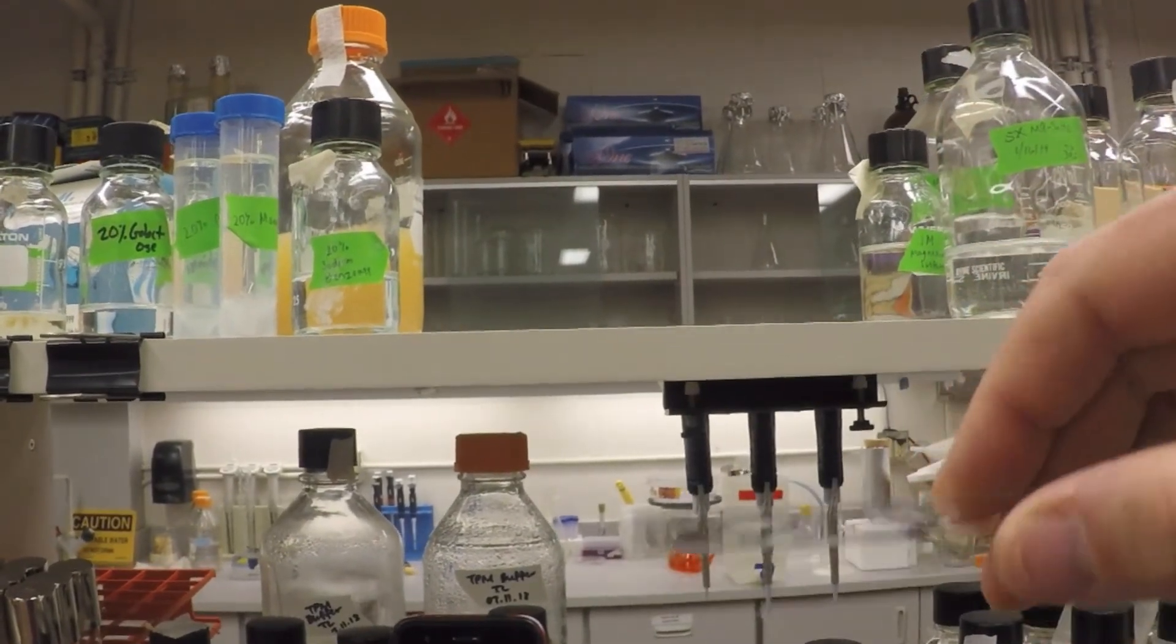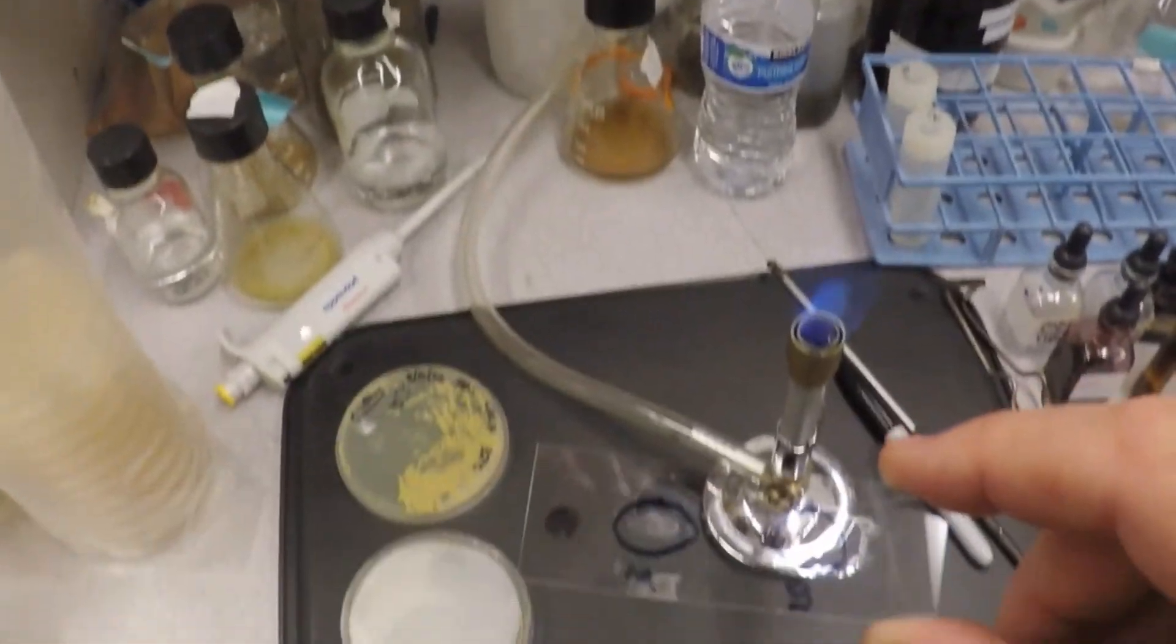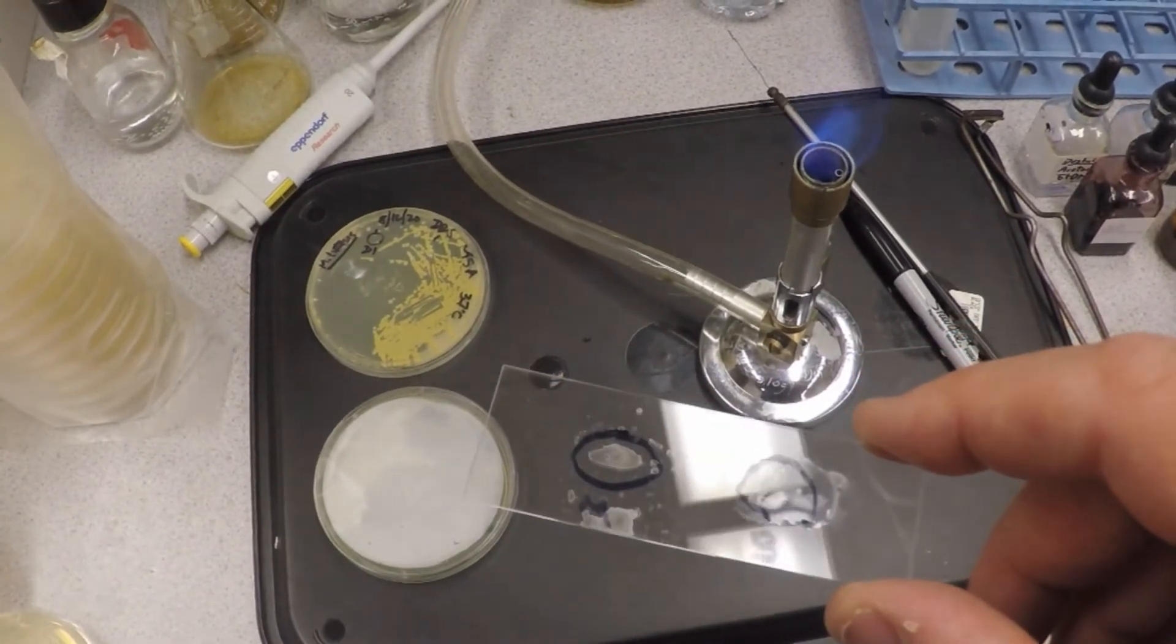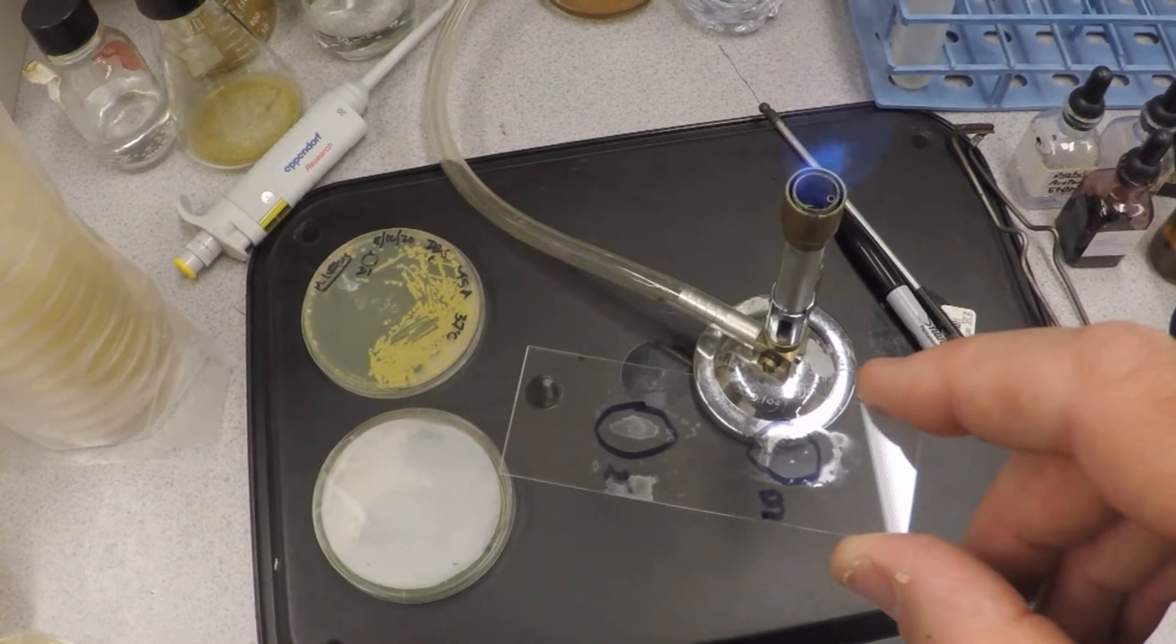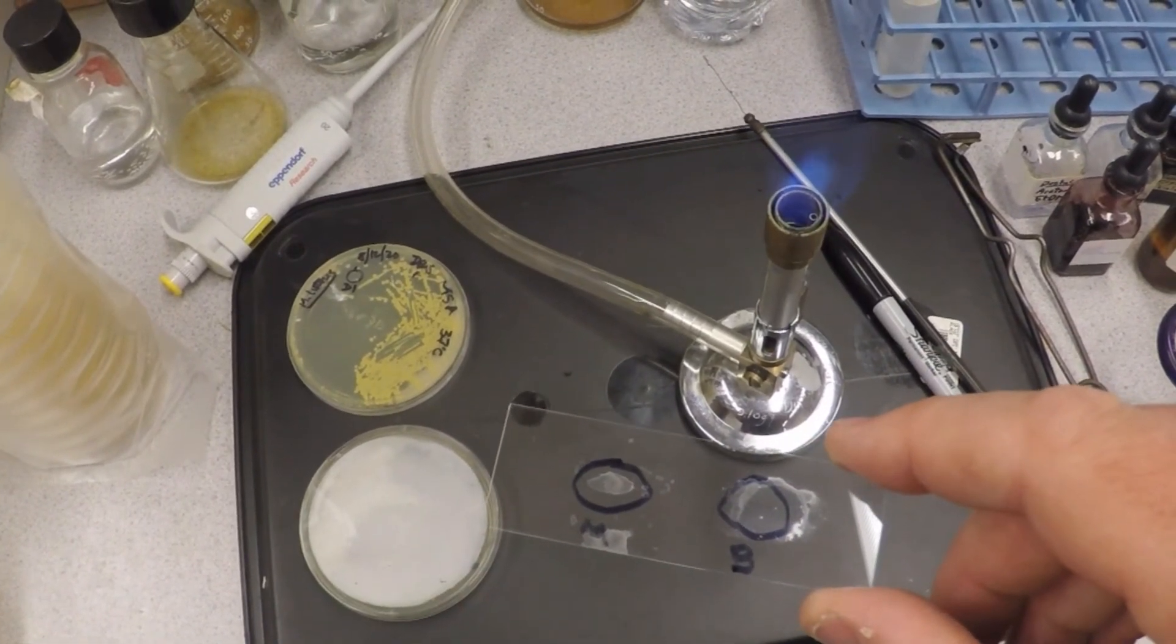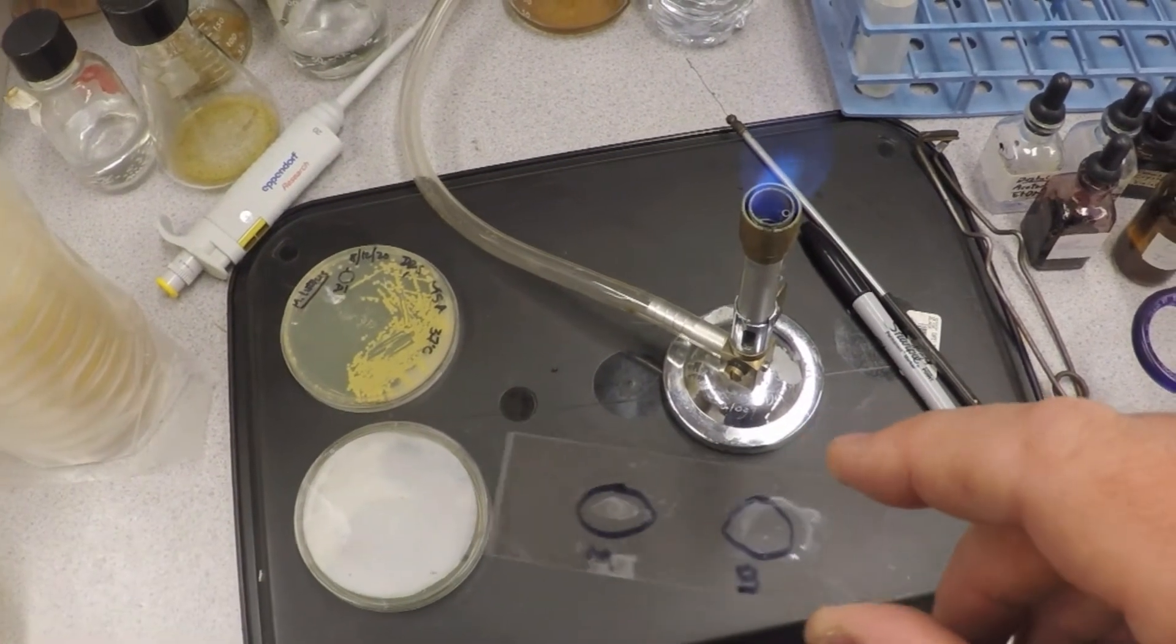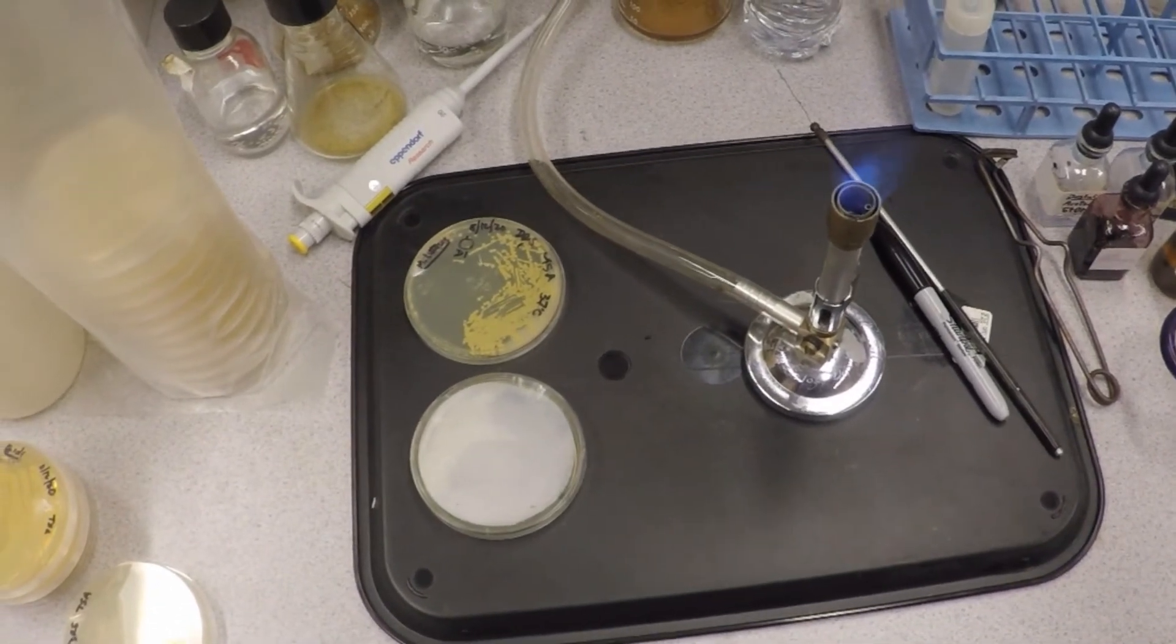Notice as it dries - can you see the little rings there of dryness in the Micrococcus side? And then the Bacillus is getting there. That's kind of what you're going to see when they dry down - they kind of dry down in little rings.